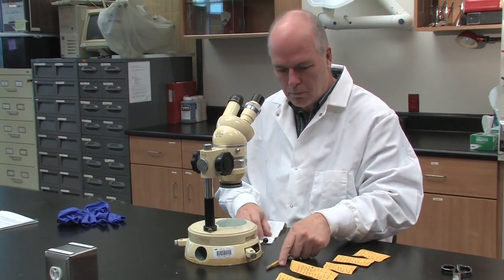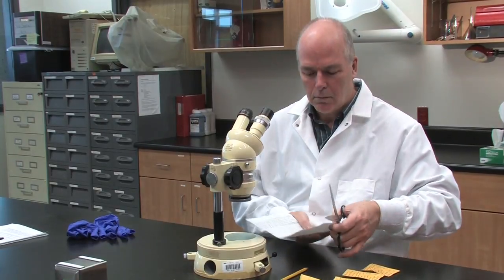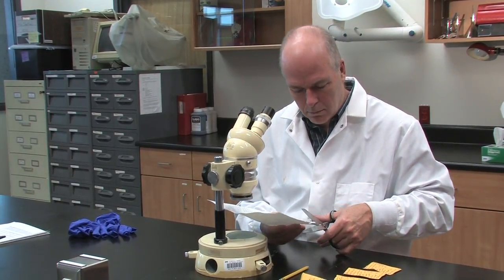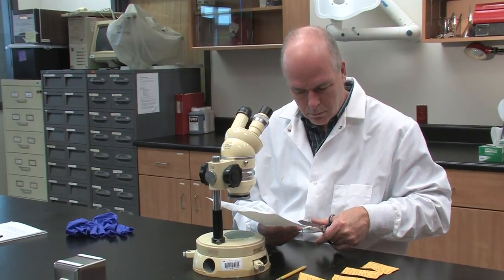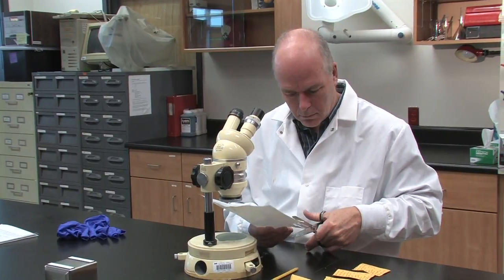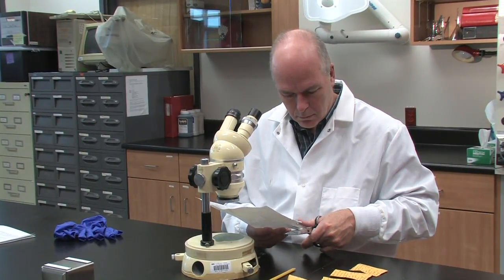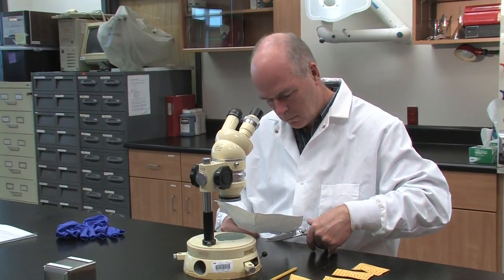When the cores are marked, make a label for each otolith. This can be done in Excel or simply written on a strip of paper. Include species and an identifier such as the sample number. Then you can simply cut the labels which will be used in the wells once the epoxy hardens.